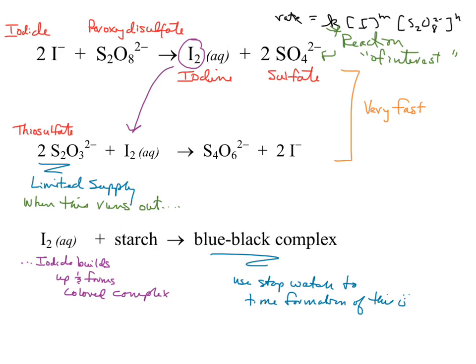runs, which, not so surprising, the next set of runs, notice you hold the peroxydisulfate constant, and you vary the I minus from high to low. Okay, so just, like I said, make sure you do this right.